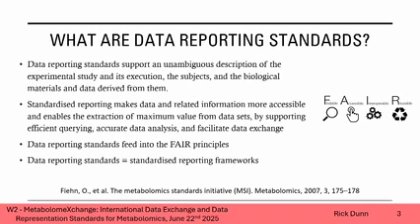So really, data reporting standards are standardized reporting frameworks. And again, if this is automated in a way, and there are some that are already semi-automated or automated, that really does help you. And it's you that has to do this, okay? And I will say, first time around, it can be a bit painful, but then once you've done it once, it's very much a copy and paste.